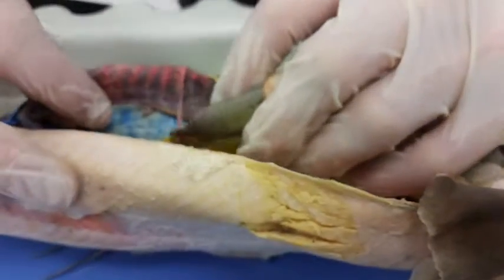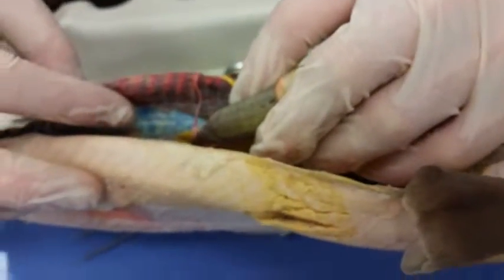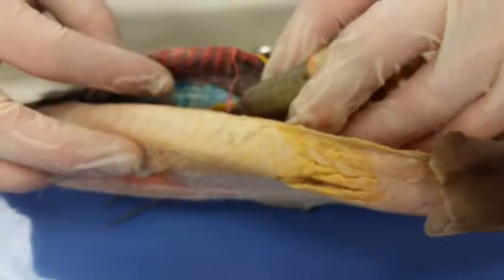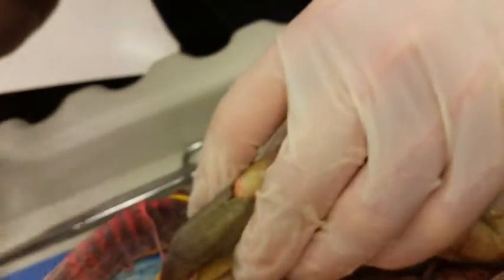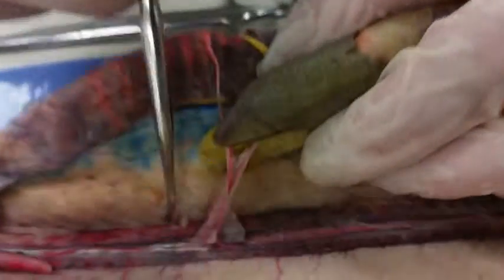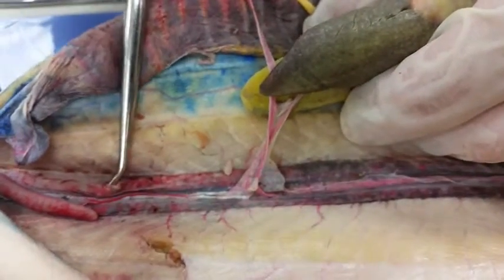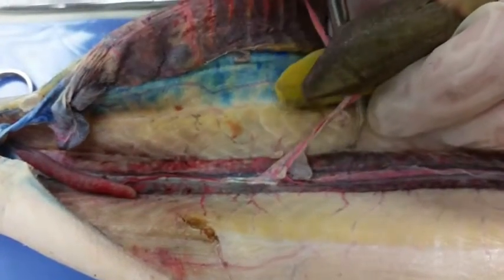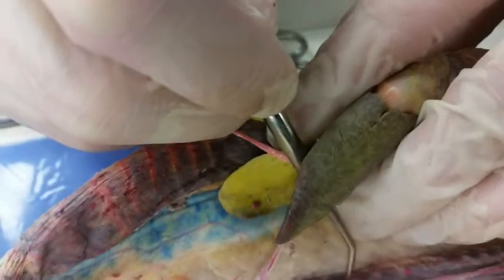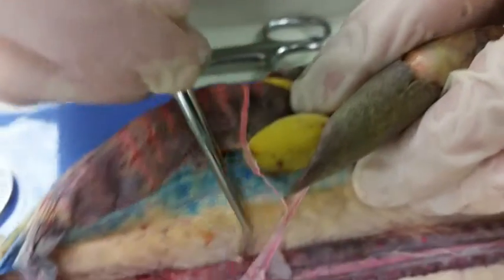valvular intestine. Well, it looks almost like it's continuous with the back, doesn't it? Yep. So I would say mesocolon just runs along here. Oh, it's right here, remember? Mesocolon. So it kind of comes down through here all the way along this kind of brownish area is mesocolon.